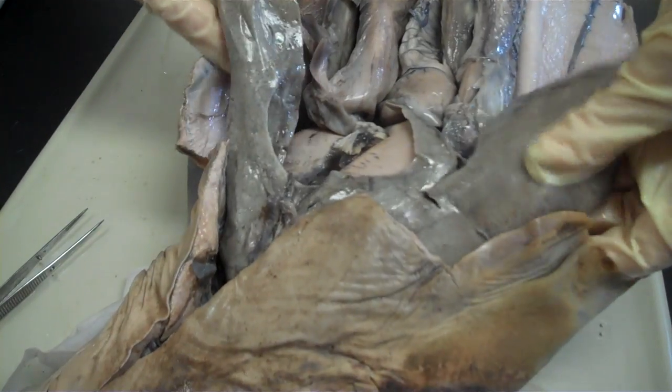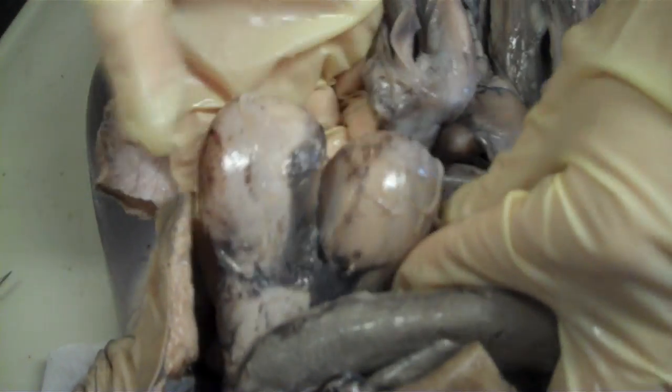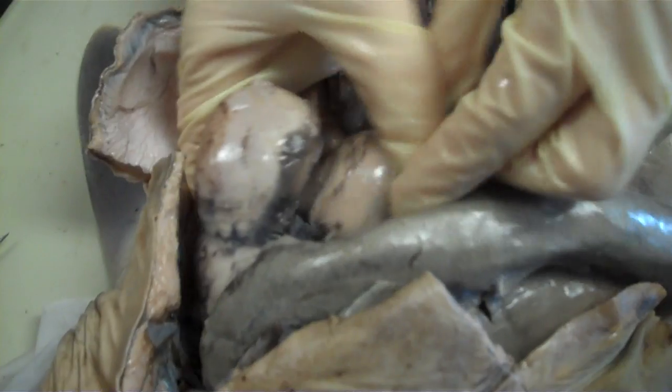So again, this would be the liver, two large lobes with the gallbladder in the center. When you move the liver aside, you find her gonads. So these are the ovaries. You can see the eggs bulging out of her ovaries.